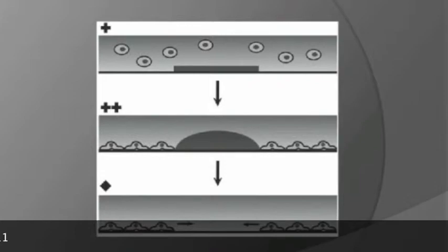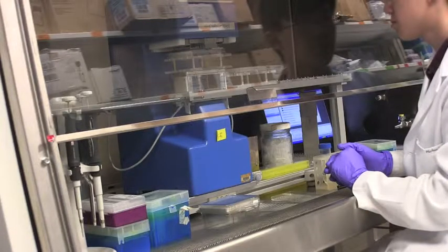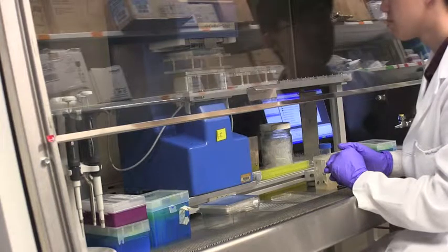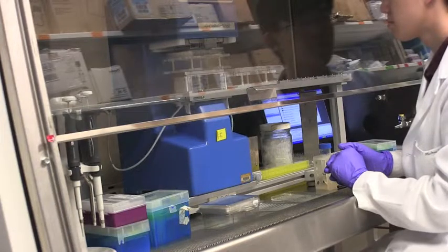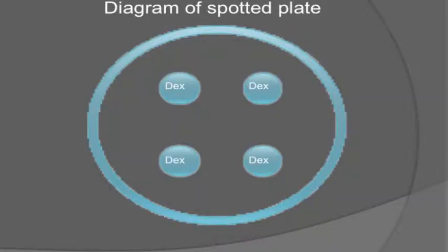We're now in the cell culture room, where a plate is being spotted with DEX. Using a SyBio program I created earlier this summer, four dextroplets, to be the wounds, are being spotted one at a time. The droplets are then allowed to dry. Shown in the diagram are four dextroplets in a single well.